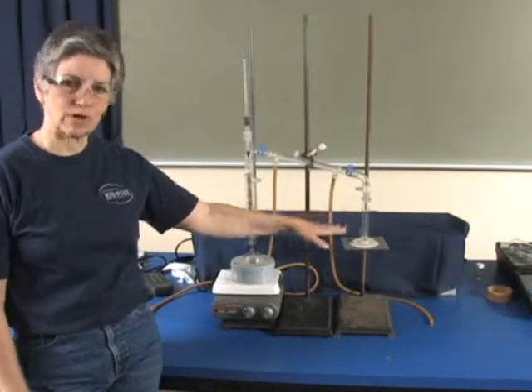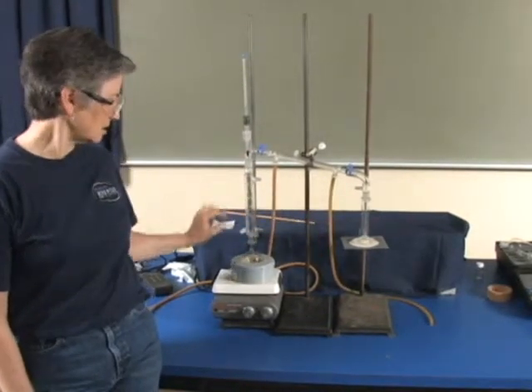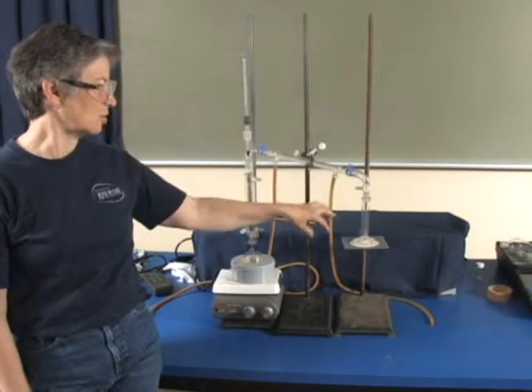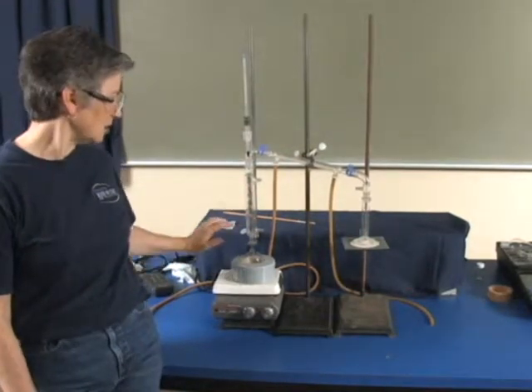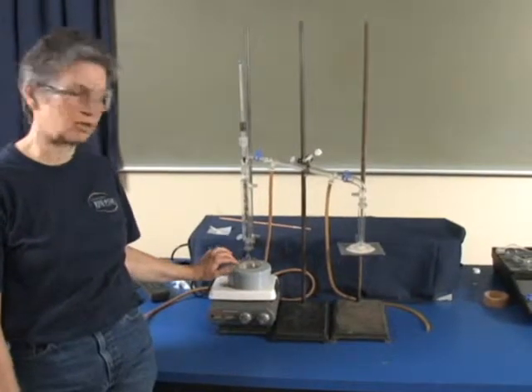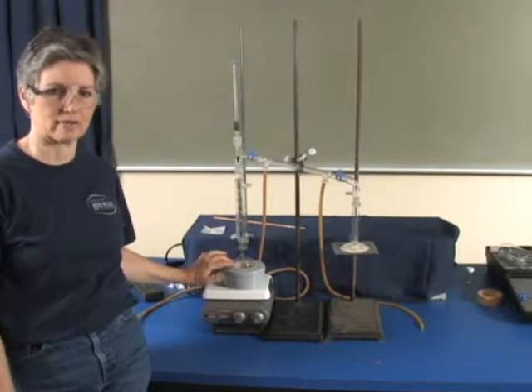The distillation range on the thermometer is measured from the time the first drop distills until your pot goes almost dry, or until you know there's a temperature change. Then you change receivers if you're separating two liquids and trying to purify them both. You never distill to dryness. You always leave some liquid around the magnet in the distillation. You always want to make sure that you see something bubbling around the magnet.